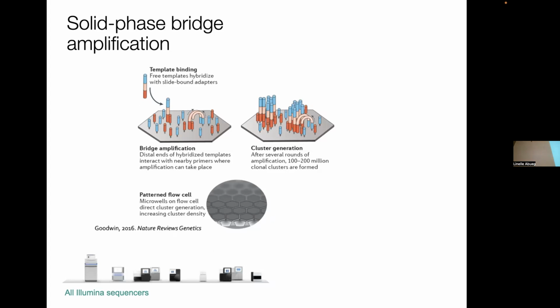On top of that, the latest Illumina sequencers have wells on their slides, right? And you can see if you take the glass one and you tilt it, you will see this rainbow reflection. It's all the patterned flow cell. It's a bunch of wells. The wells allow you to load with very high density and still keep the clusters separate.